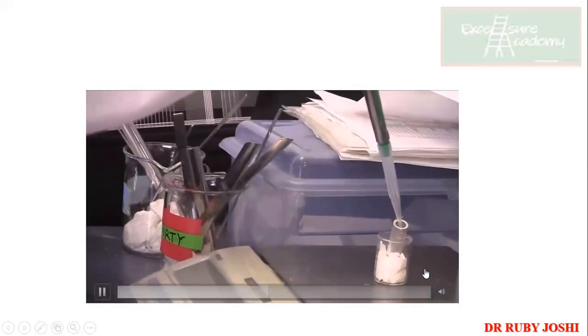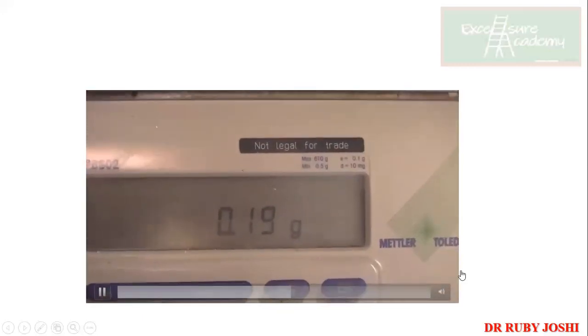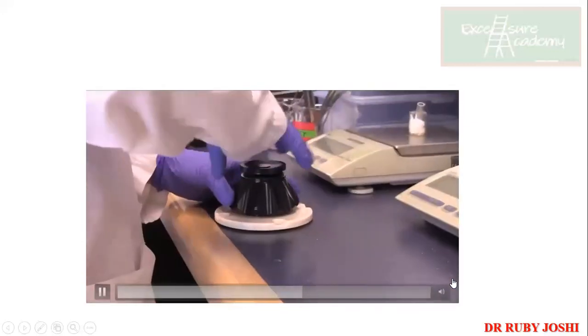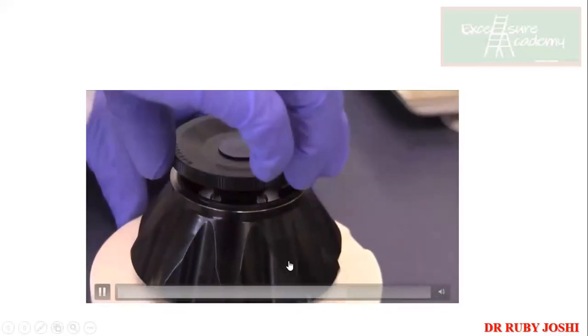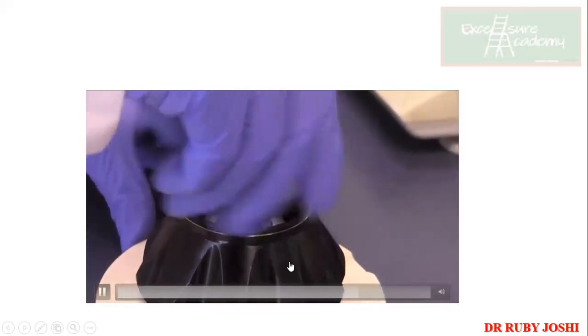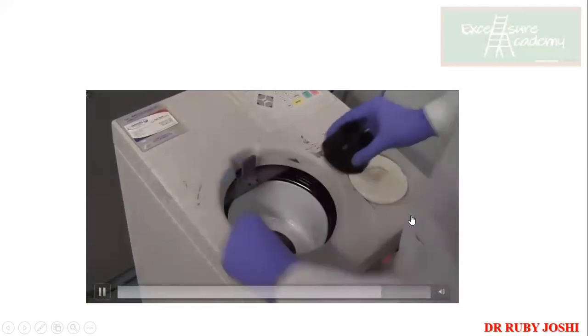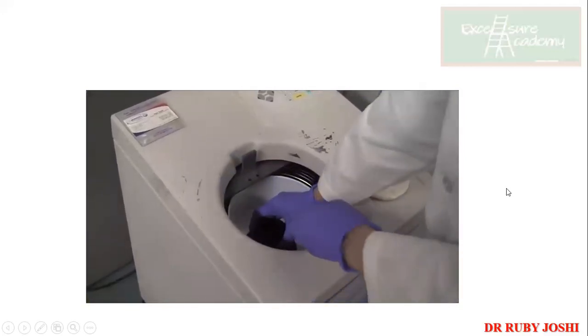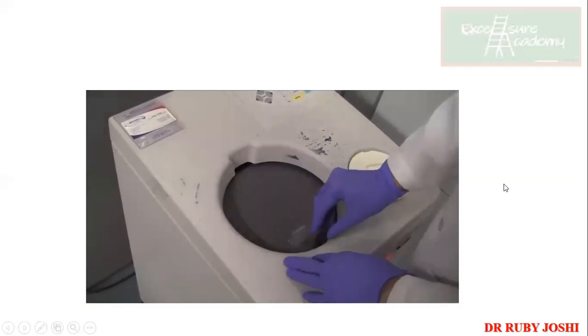Then it will be centrifuged. So whatever debris is there will settle at the bottom, and on top, in the supernatant, you're going to get your protein suspension or protein solution. This is the rotor into which you're going to keep your centrifuge tubes. And this is the machine. So this is your ultracentrifuge actually. Okay, clear? Sonication is clear?